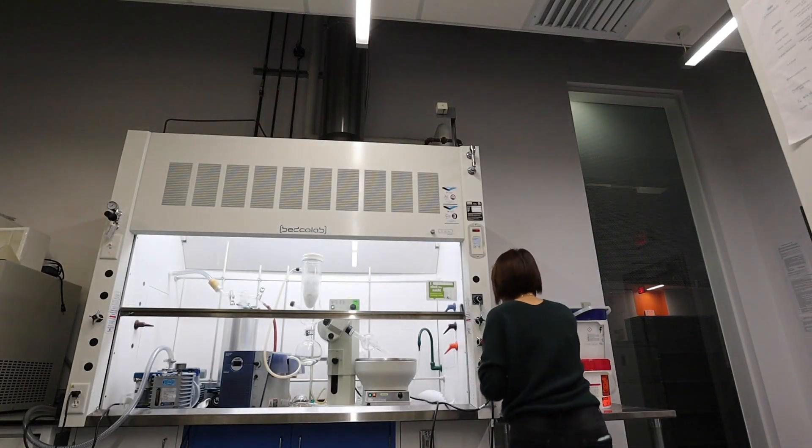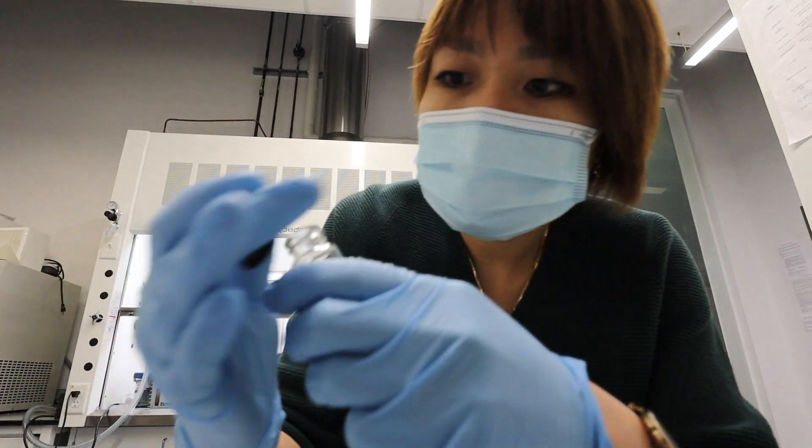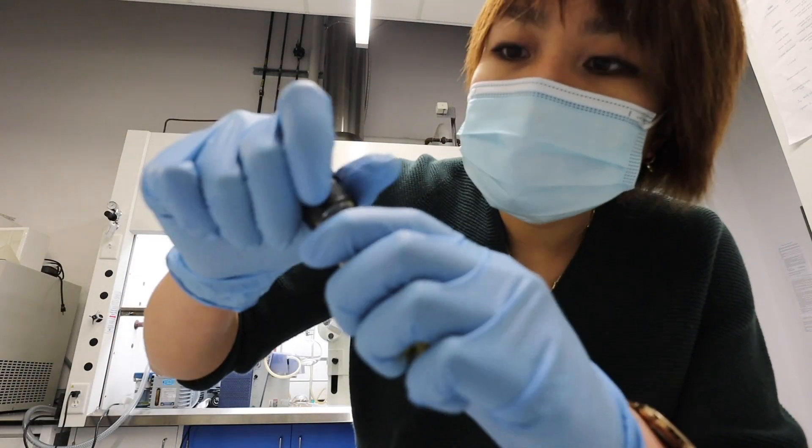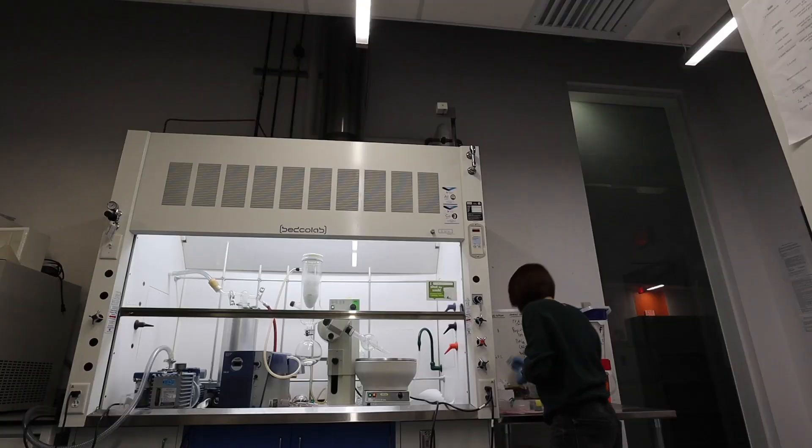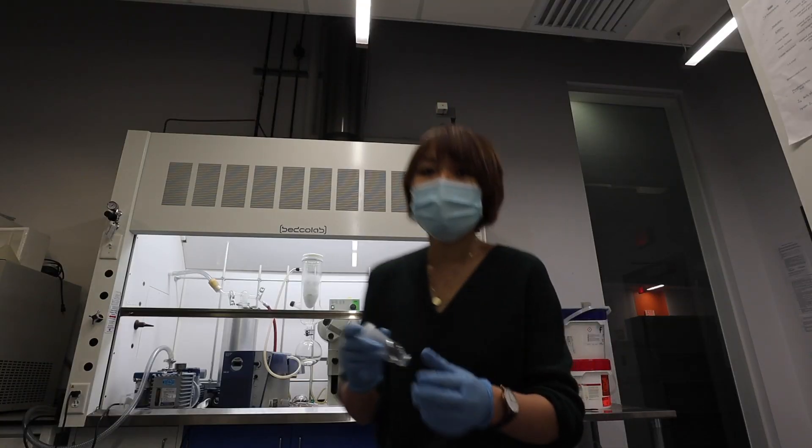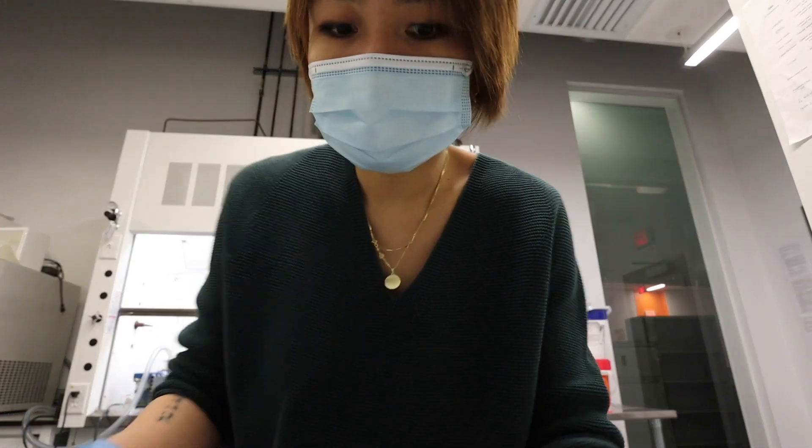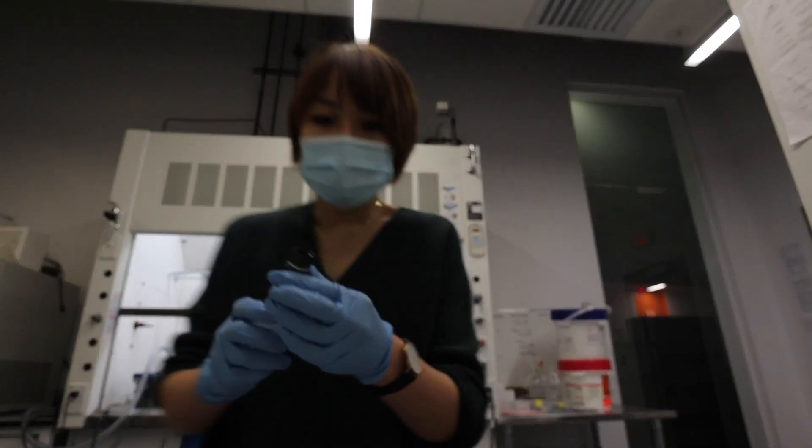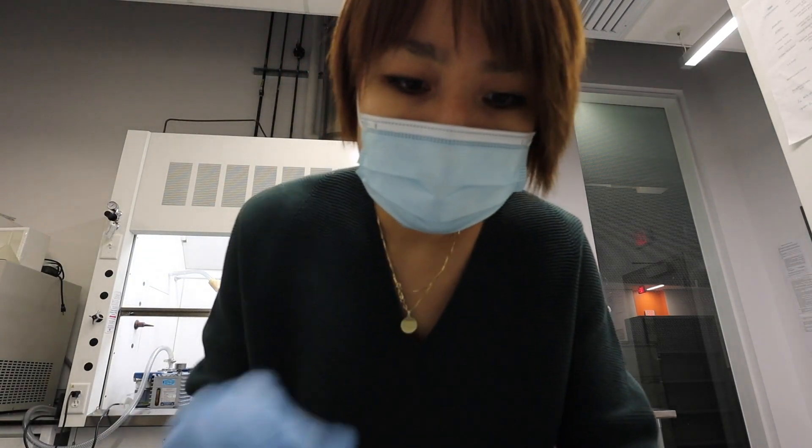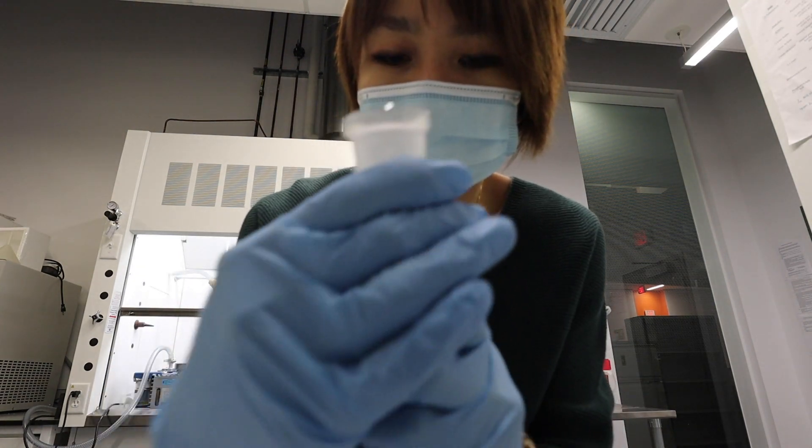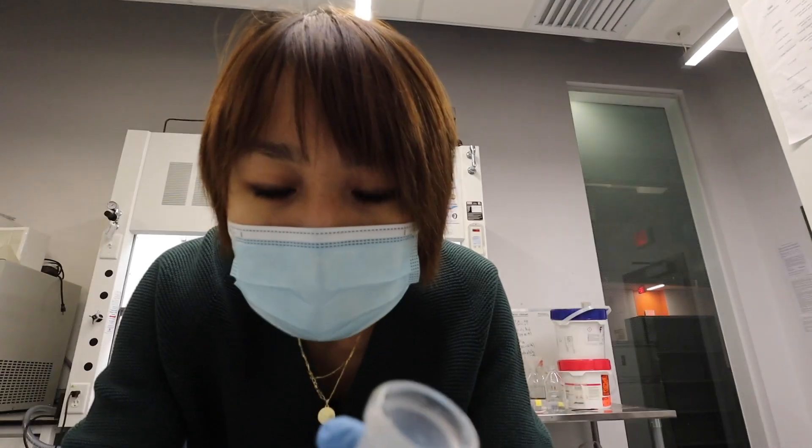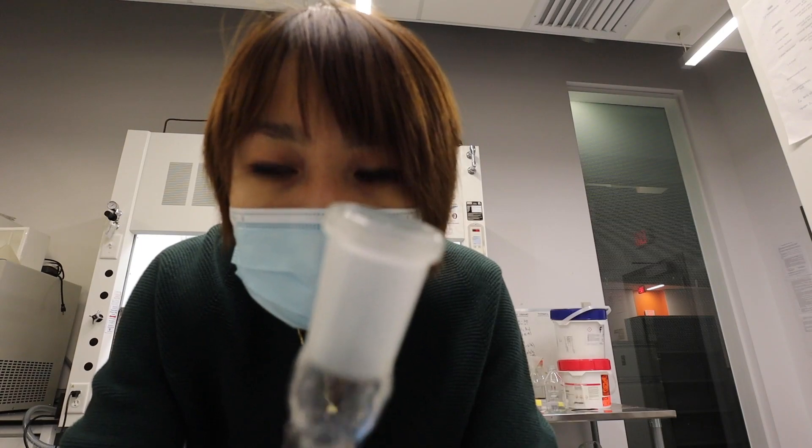So I usually use this adapter thingy to connect it to the rotovap. That doesn't fit. Okay, it's the wrong one. This should be the right one. Does it feel loose? Okay, it is loose. Nice.